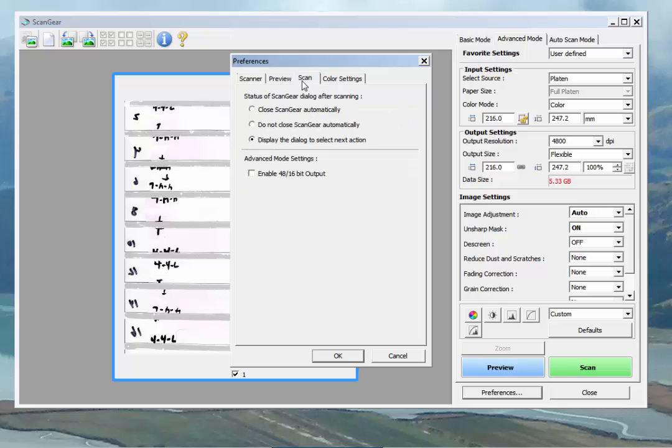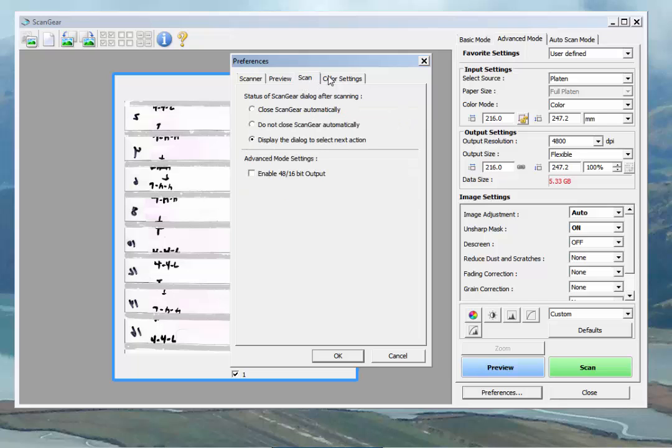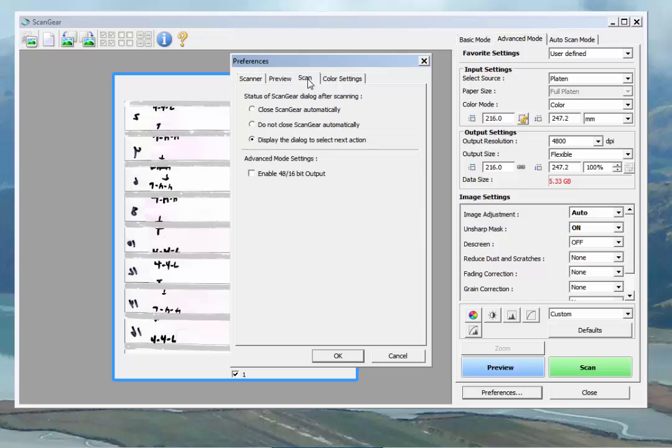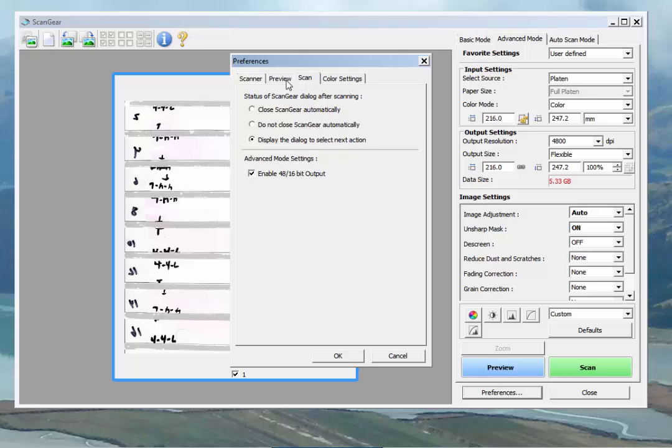We don't need to worry about monitor gamma. We'll click over to scan settings and enable 48 and 16-bit output.